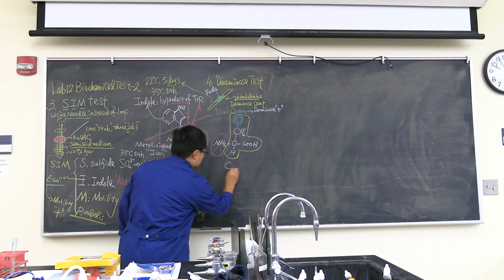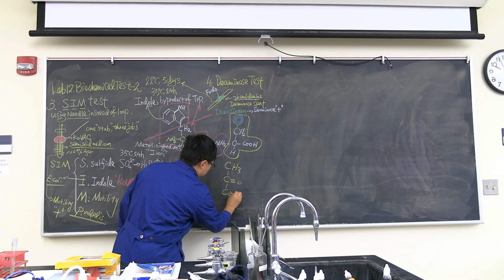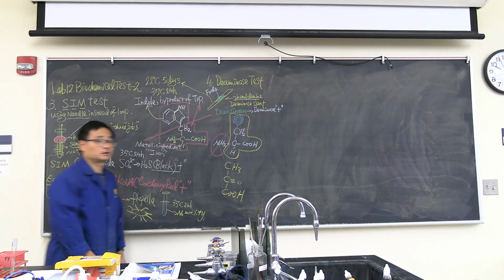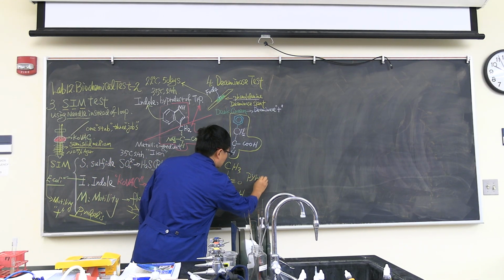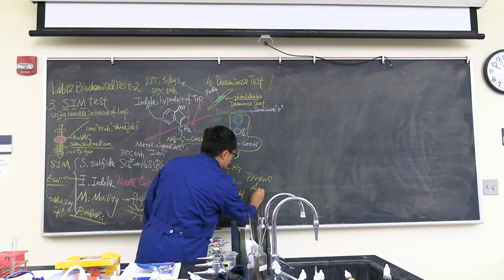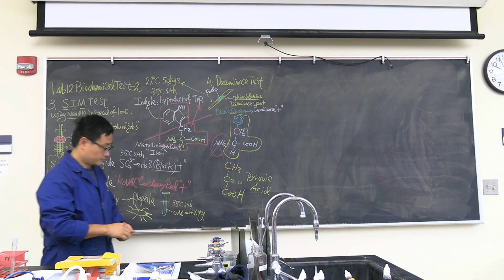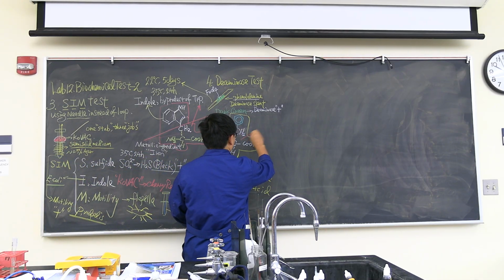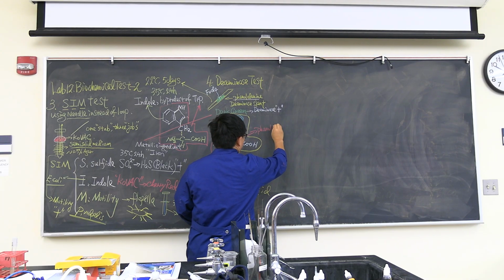Do you know this? This is pyruvic acid. Then what is that? Very similar. Phenylpyruvate.